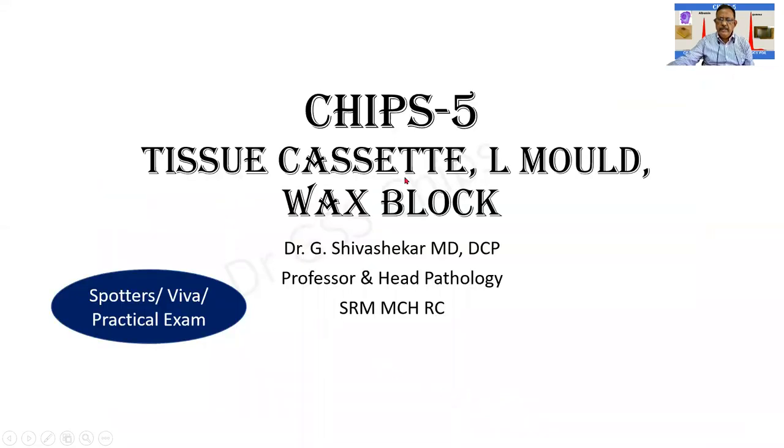The instruments that I'm going to deal with in this session will be the tissue cassette, L mold and wax block. All of these are important spotters as well as the source of questions in the Viva. Also, it can be kept in the practical examination for description. Kindly follow.